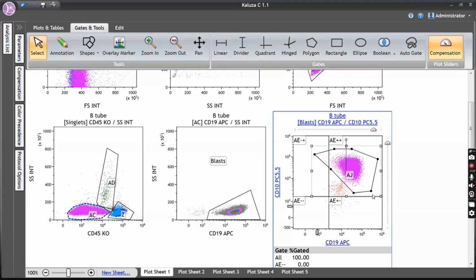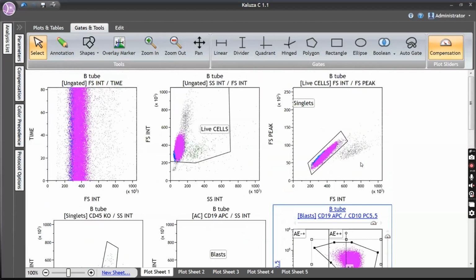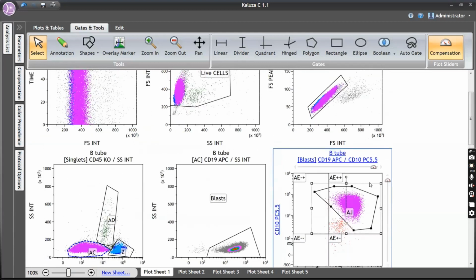Initially, it was not much important, but now, since there's a targeted therapy for CD22, when you diagnose a case of B-ALL and it relapses later, they come to you asking how was CD22 expression at the baseline or during the relapse. So at that time, if CD22 is there in your panel, it's very good. Inotuzumab will be given, right? Anti-CD22 therapy. So better you have CD22 in your panel. It's good to have that. Okay. Right. Now, this is how I'm going to call.